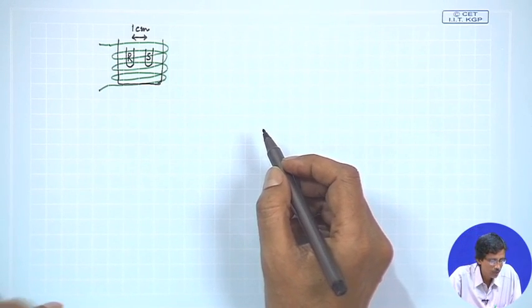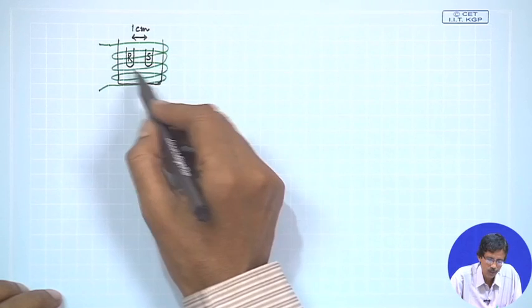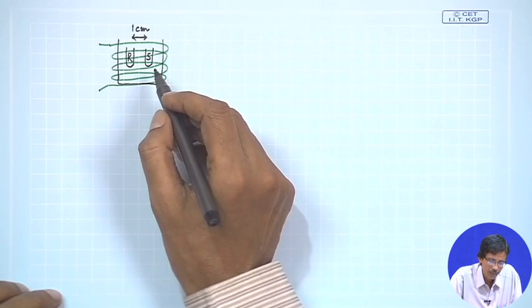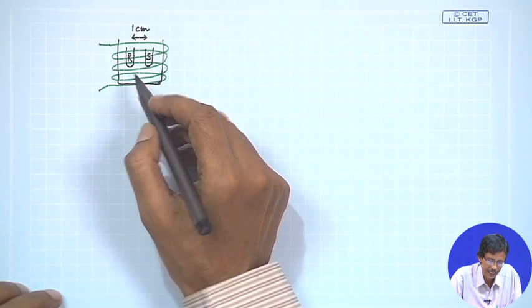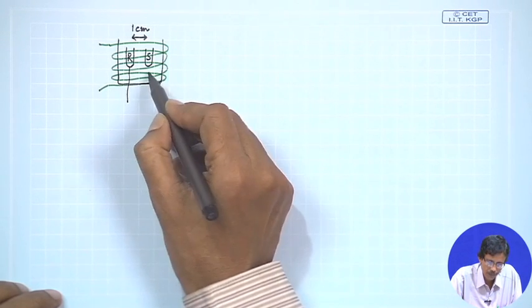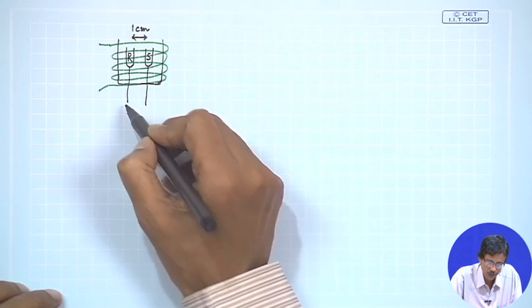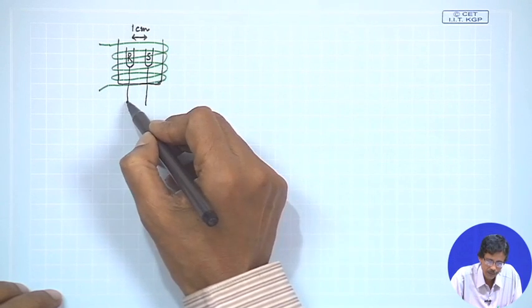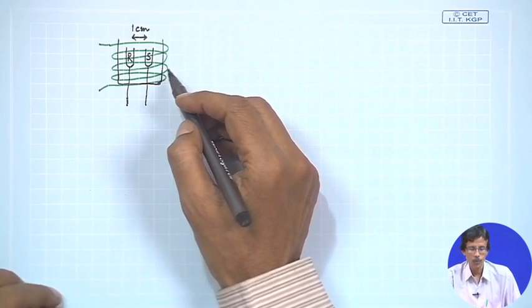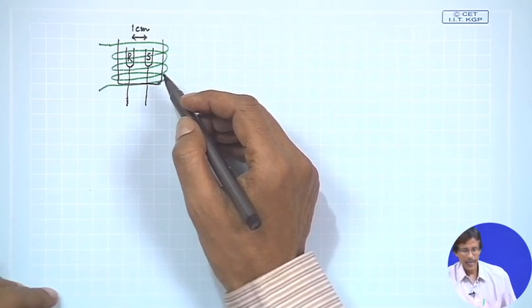So, two symmetrically located and identical chambers, these crucibles, can also be separated, because we have to have some connectivity from here for recording the corresponding heat effect. Sometimes one instrument can be common, because we can record both the TG plot and the DTA plot.